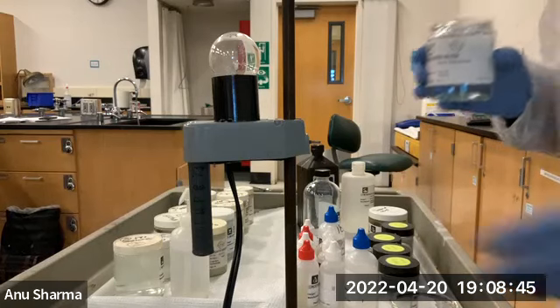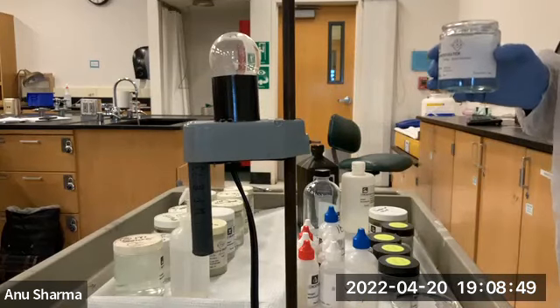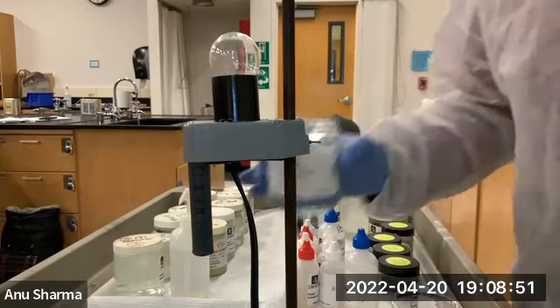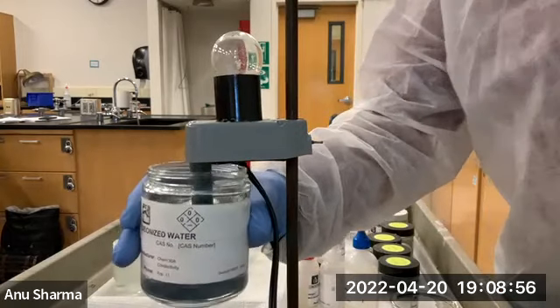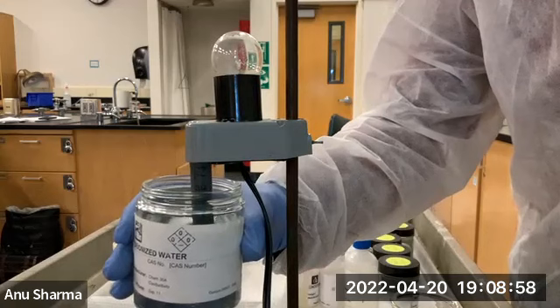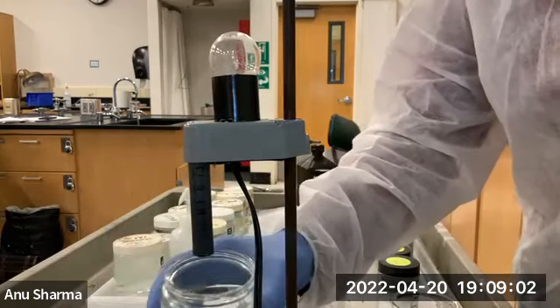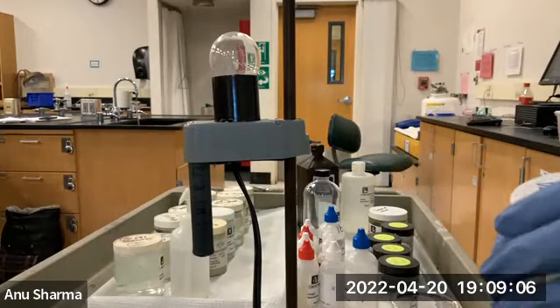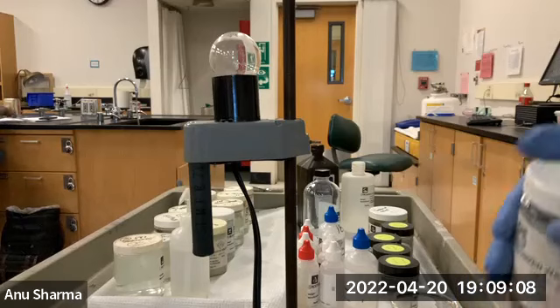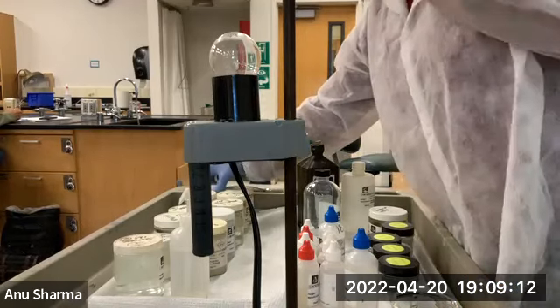So now, what do you guys make a prediction? Will it ionize or not? Deionized water. What do you guys think? None, because water just by itself will not ionize. So you just put here on the table that it is a non-electrolyte, and then the major species is H2O molecules, this water, okay?